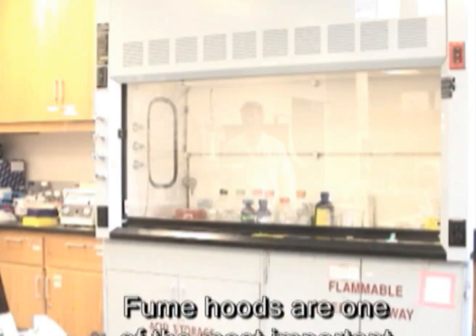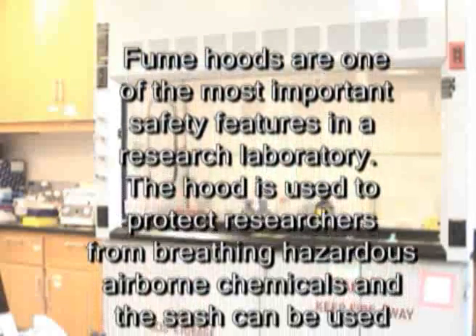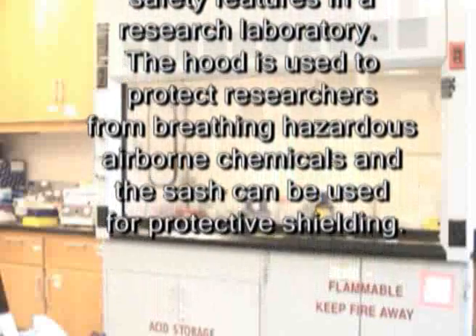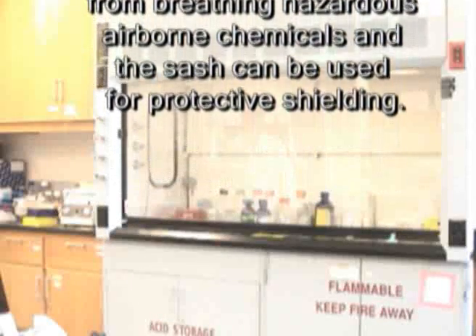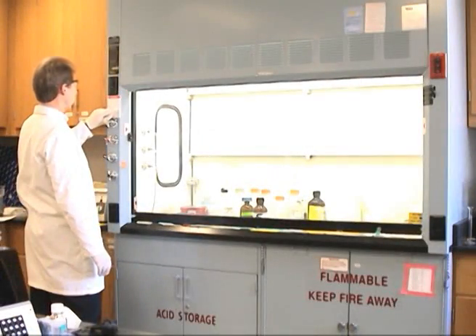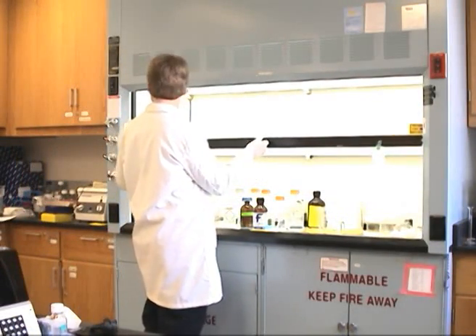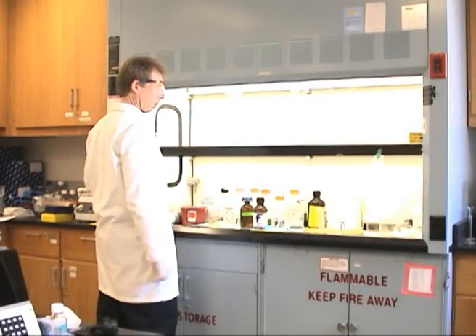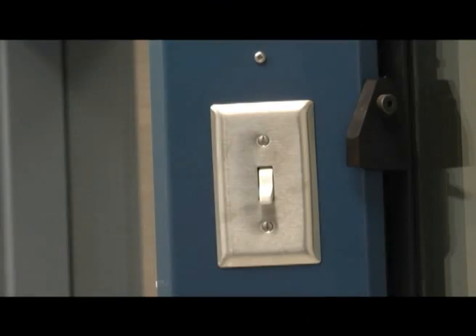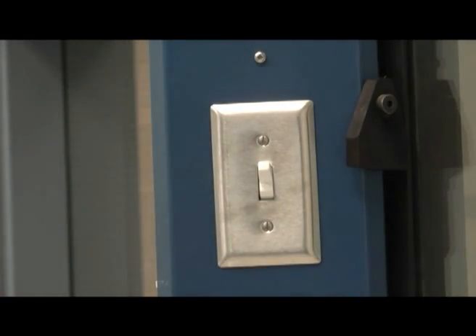Fume hoods are one of the most important safety features in a research laboratory. The hood is used to protect researchers from breathing hazardous airborne chemicals, and the sash can be used for protective shielding. This presentation demonstrates how to use your fume hood properly to better protect yourself and our environment from exposure to hazardous materials. When you use the hood, you should turn on the hood light so you can see clearly.